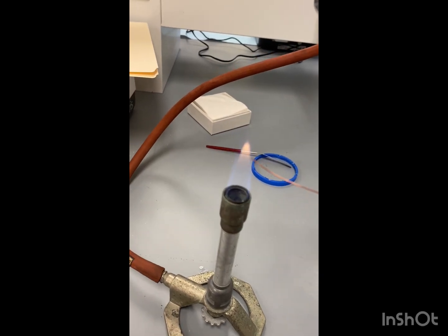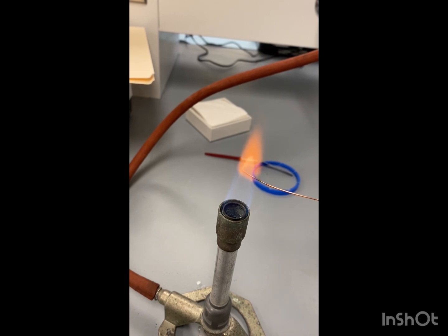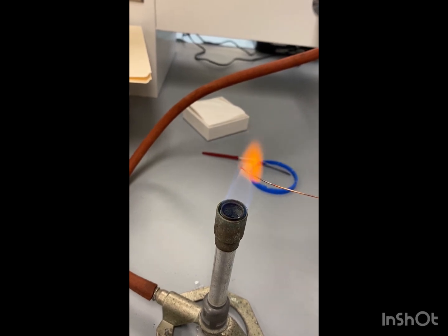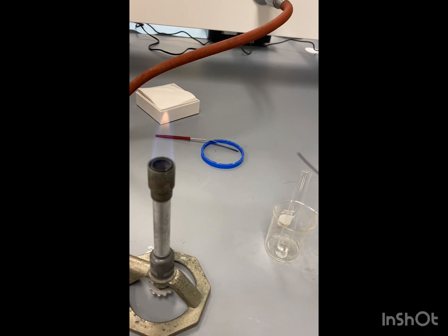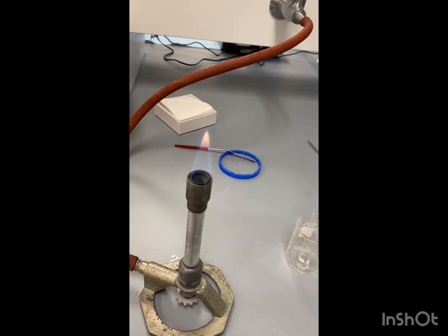So my copper wire — first we're going to get it until it's red hot. We're going to let that cool, and we're going to get our solution and then do the flame again.